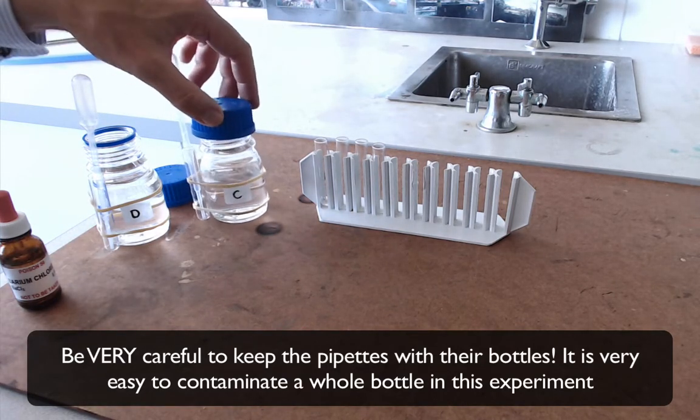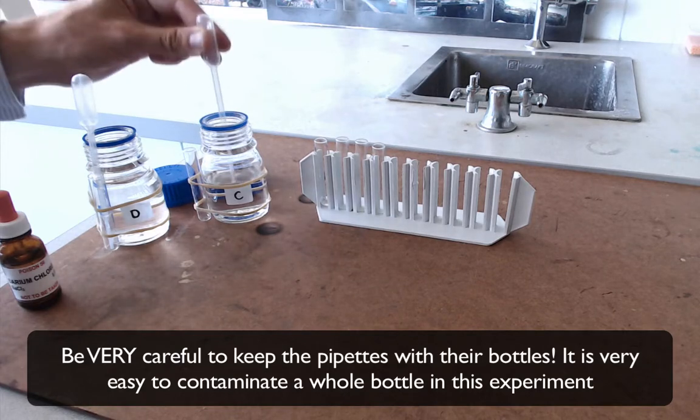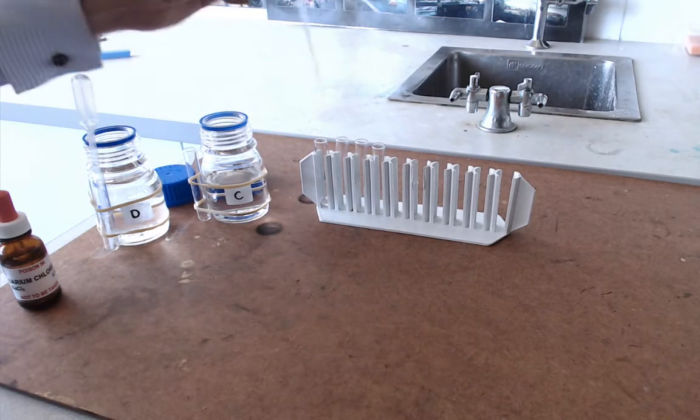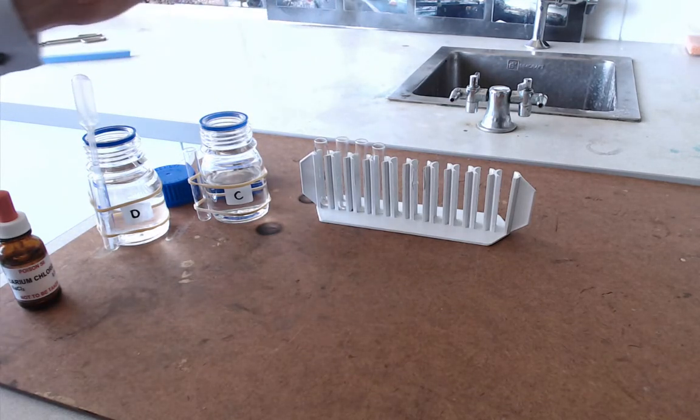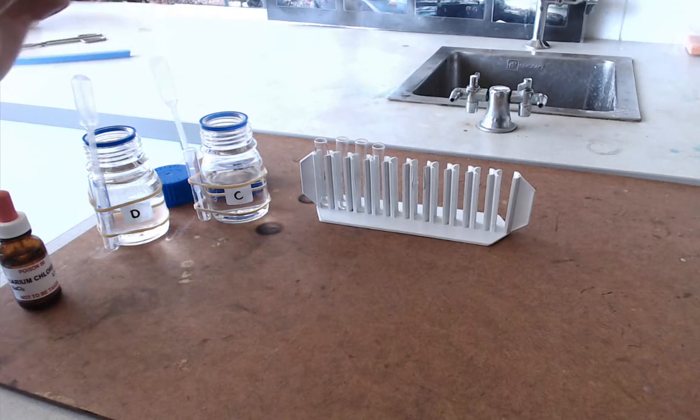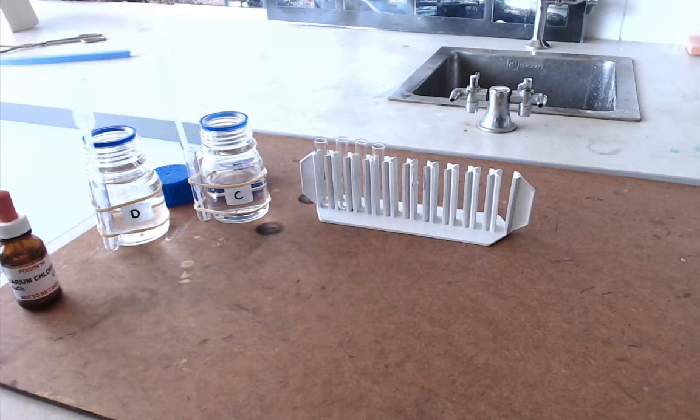Then take a few drops of your other substance that you're testing. So in this case I've got C and I'm going to put a few drops of that into a different test tube. Now be really careful where you put your pipettes after you're done.